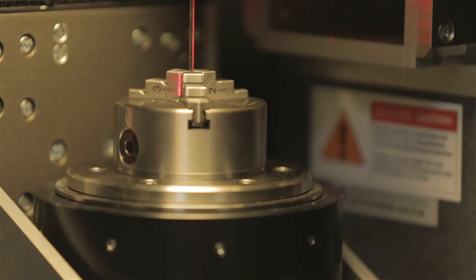I'm a paleontologist. I study humans and other forms of animals that are fossilized. Nano CT will be quite useful for this because some of the objects that we're interested in examining are quite small. And the new facility in the nano CT, especially here at Stellenbosch, will be extremely useful because it represents a technology that previously hasn't existed in South Africa or Africa for that matter. So we're quite excited in the paleontology world to begin working with this device.